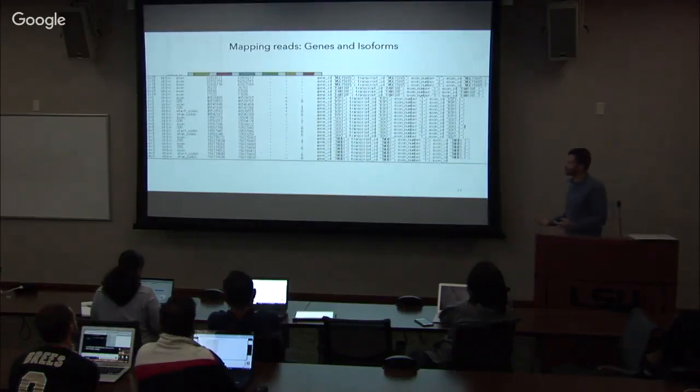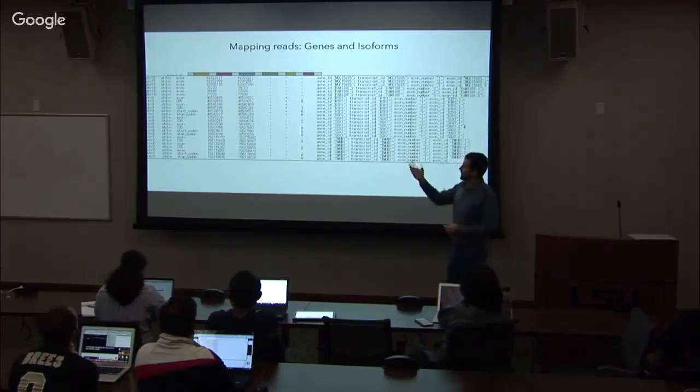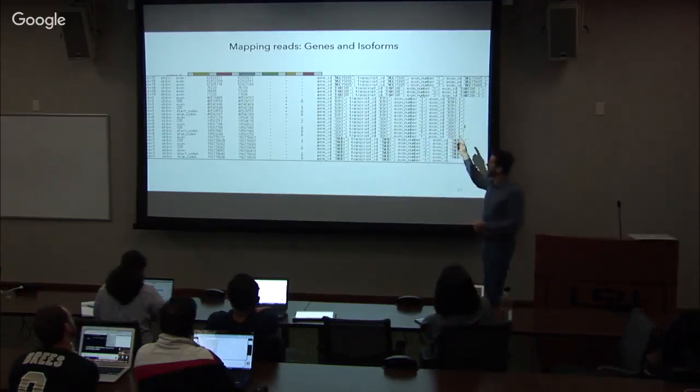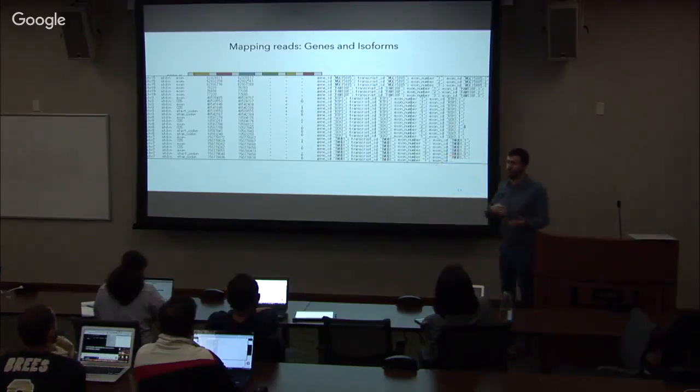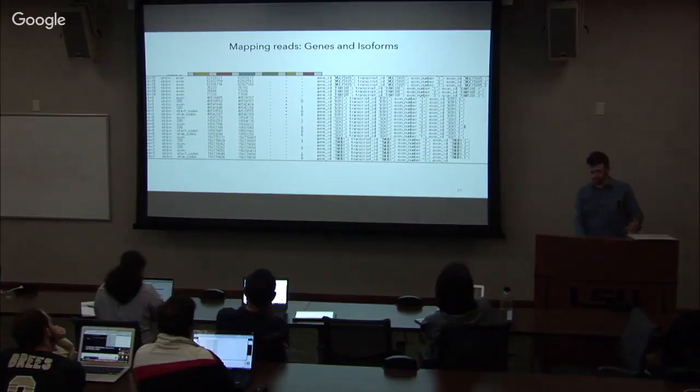And just to give you a reference, what does the GTF file actually look like? So this is an example of what it looks like. You can see the beginning, chromosome 15, for example. You have an exon. It starts from a certain position on that chromosome. It ends in a certain position on that chromosome. And then you can see that it has a name. And so what is that taxonomy of names? You have a general name for the gene, and then you have a variation. So however many numbers of exons you have in that gene, and that's what you get in the final table. So this is to clarify the data that we will be referring to.